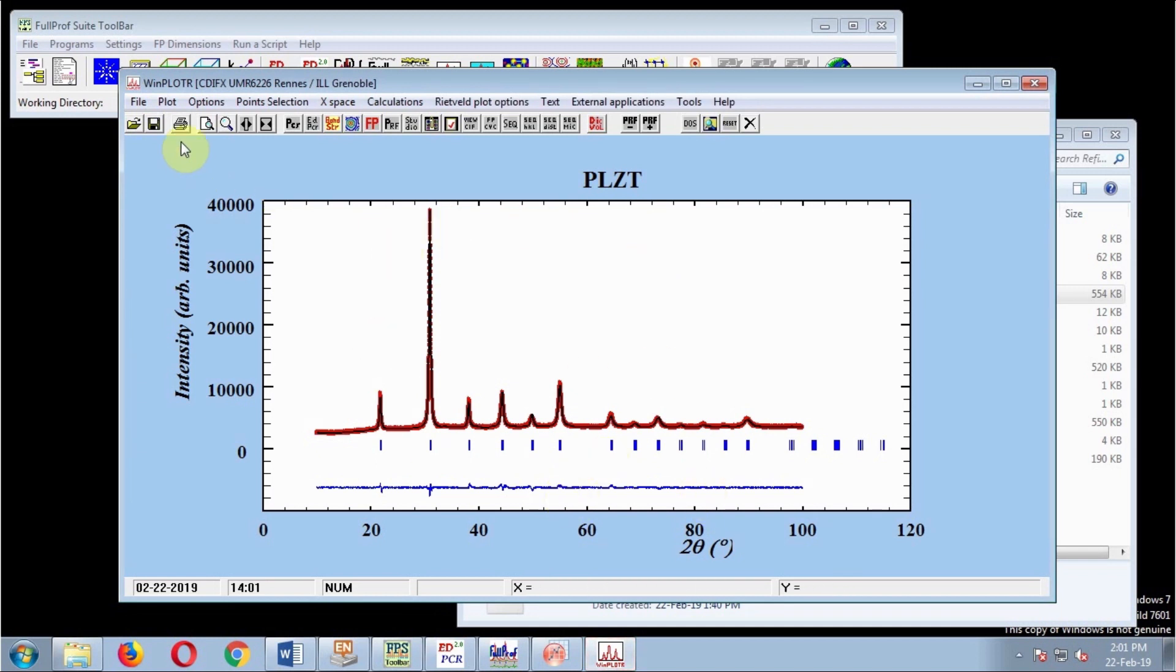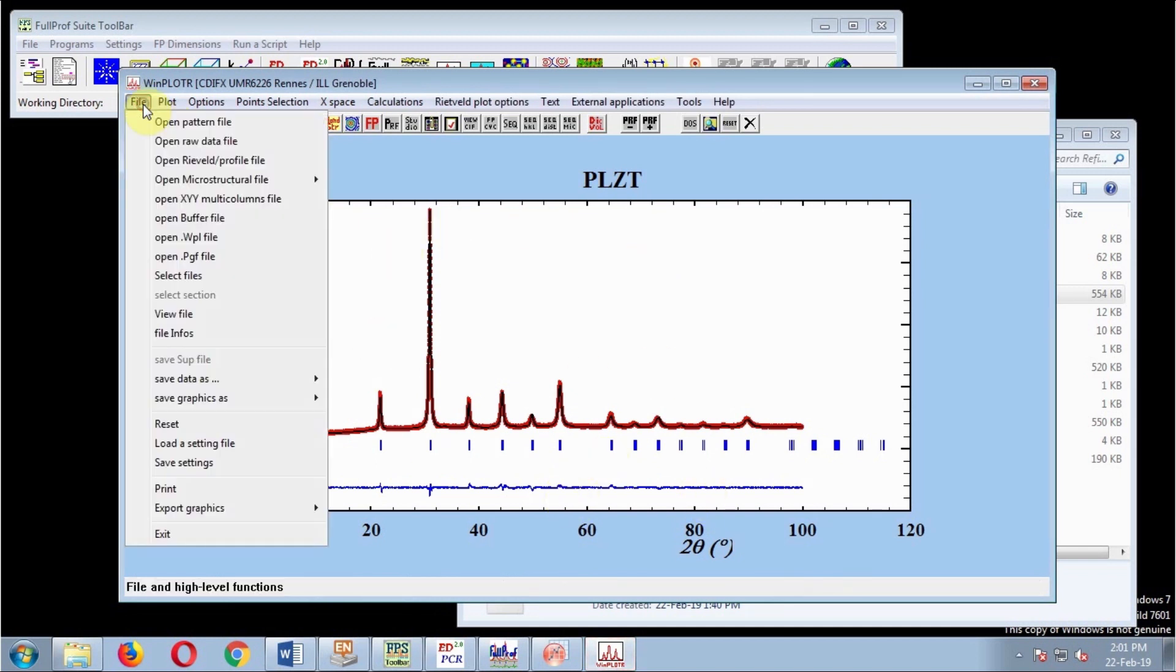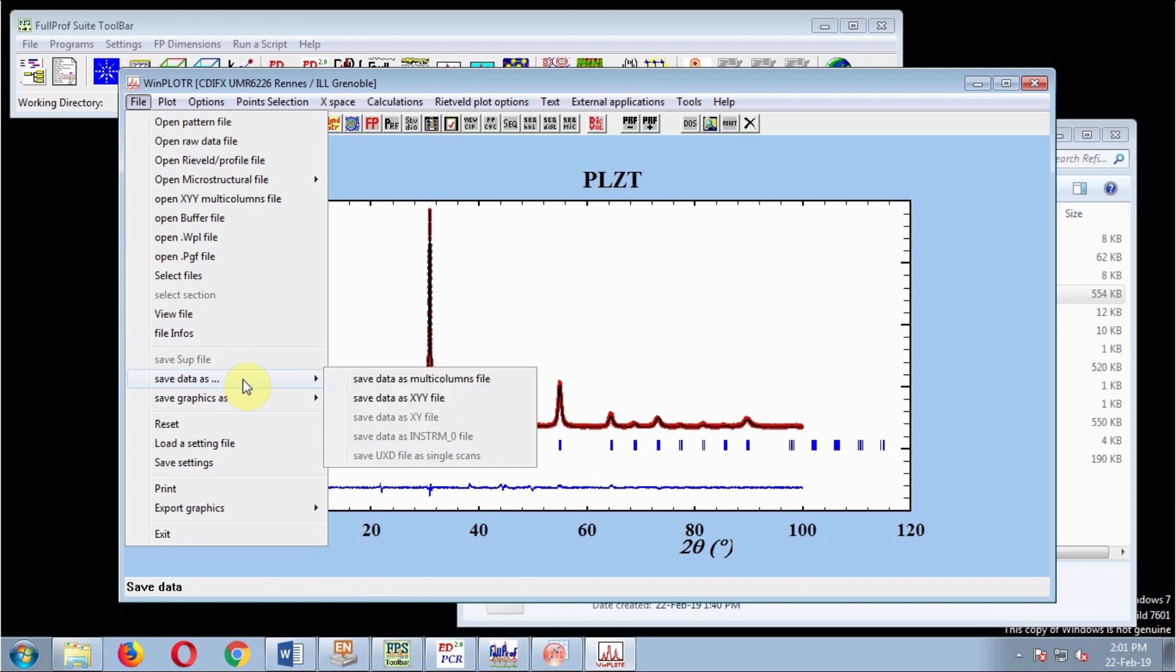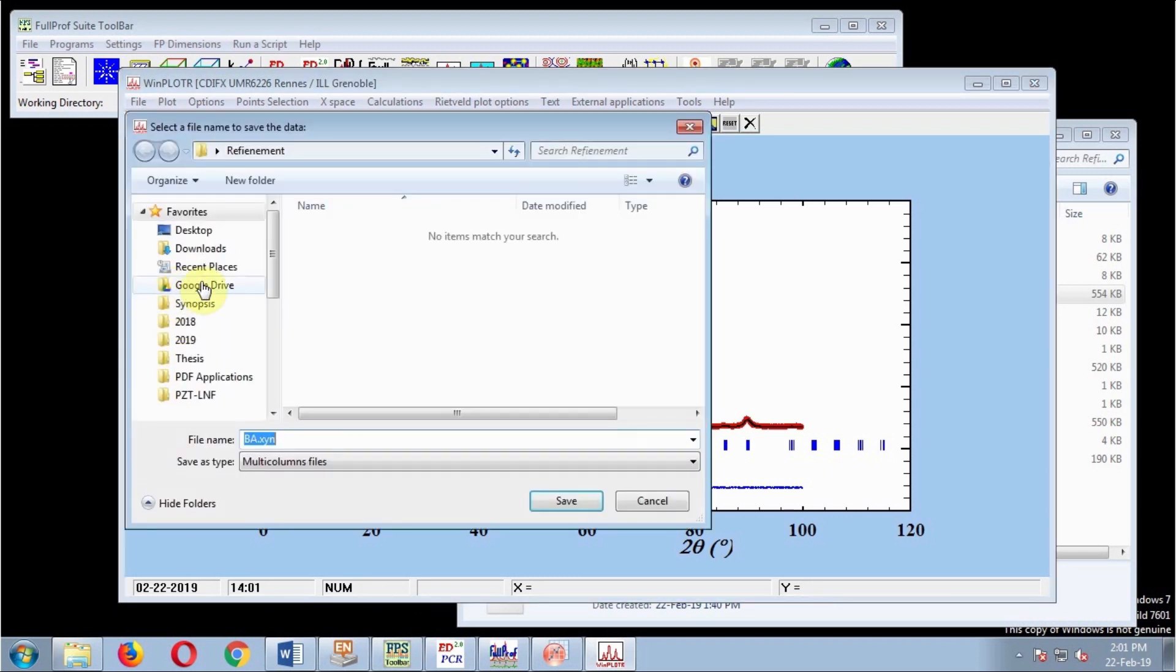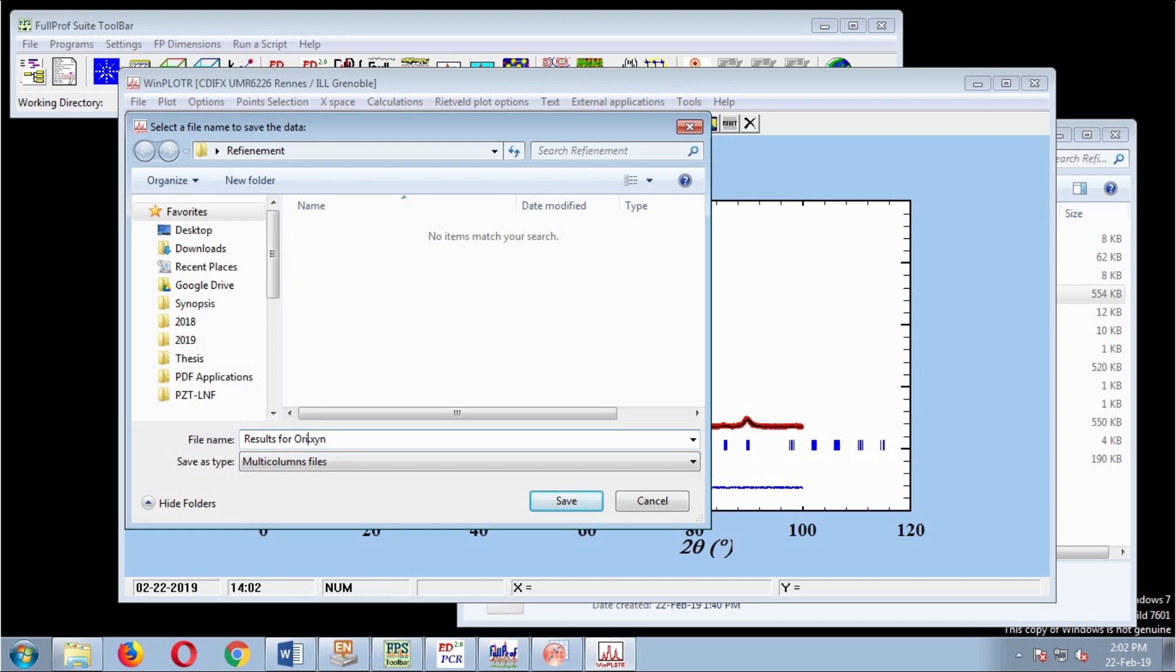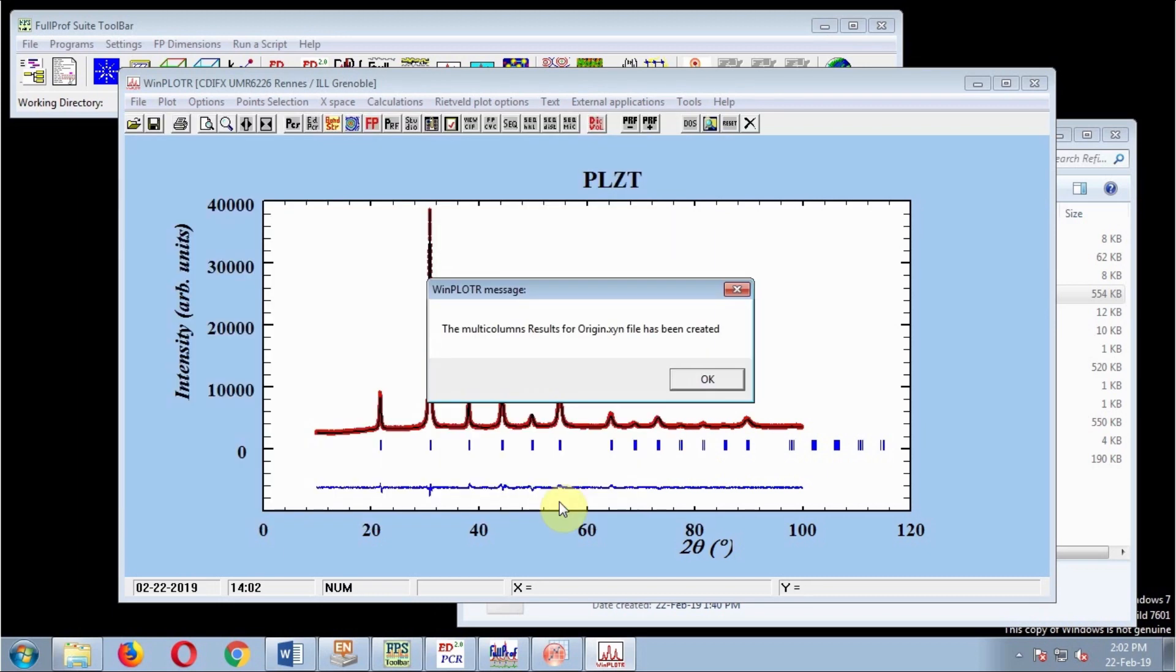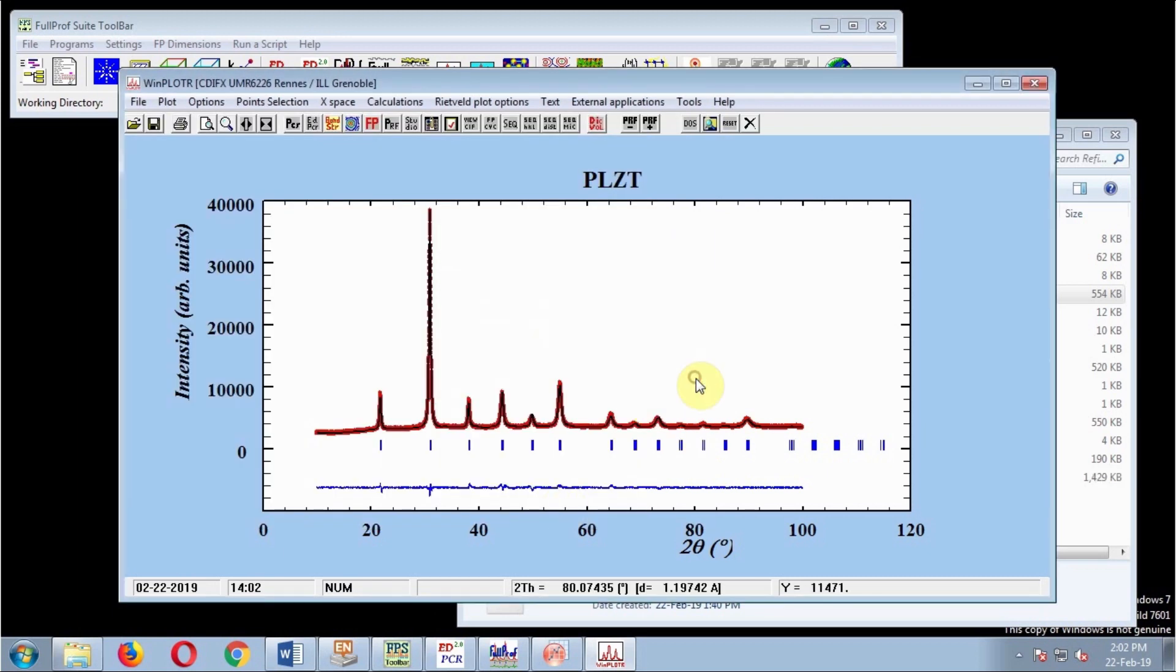To save this in a file format that Origin can read, save data as multi-column file. Here all boxes should be checked if you want all components of the graphical result to be in Origin. Change the file name if you want. I'll name it 'results for origin.' Save, OK.